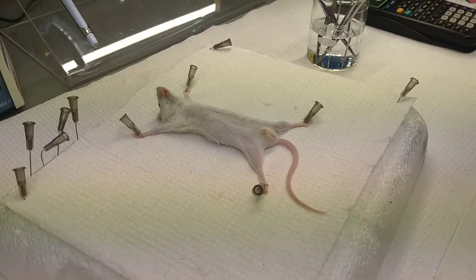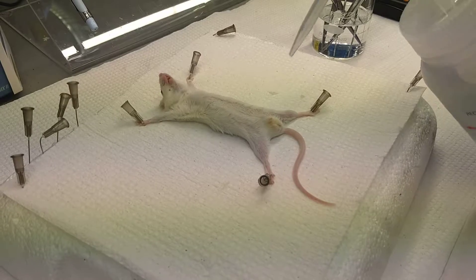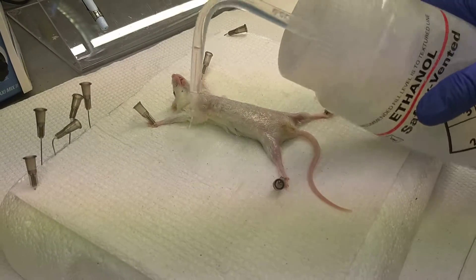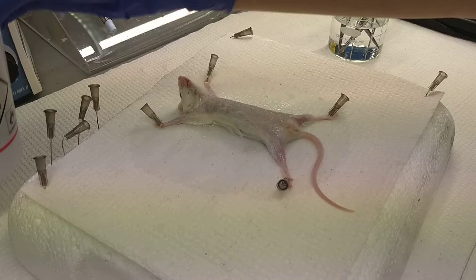I've taken the mouse and pinned it on its back with all four limbs pinned down. You want to get the mouse stretched out so you can easily cut through the skin without cutting the peritoneum. Sufficiently ethanol the mouse down.